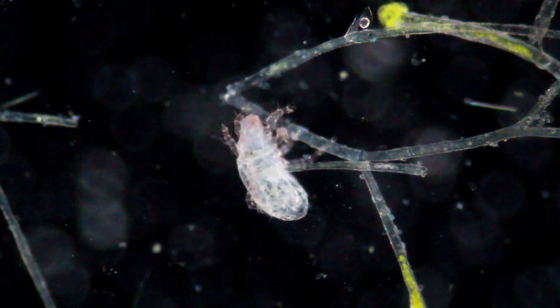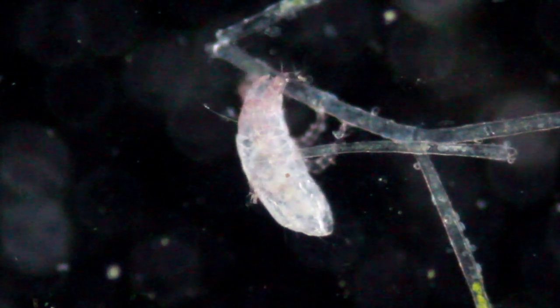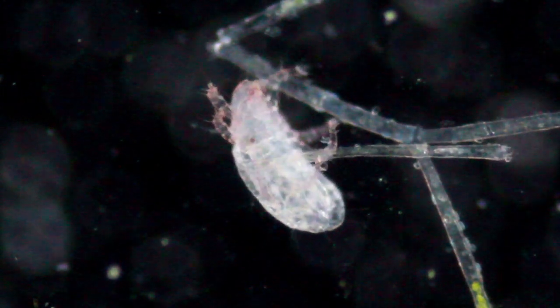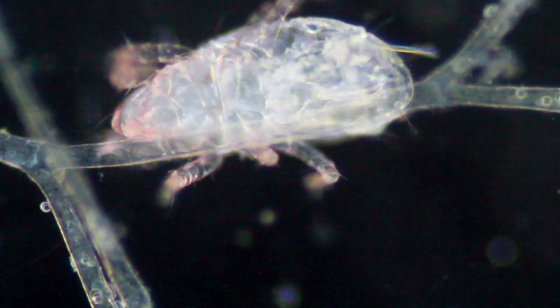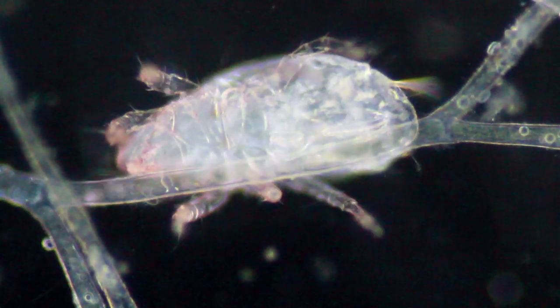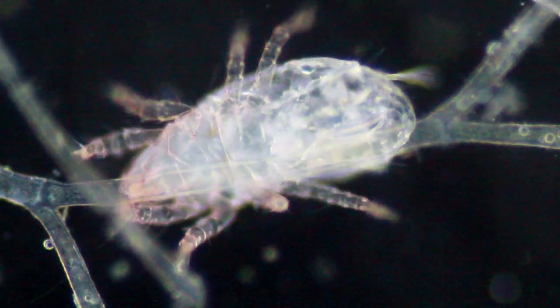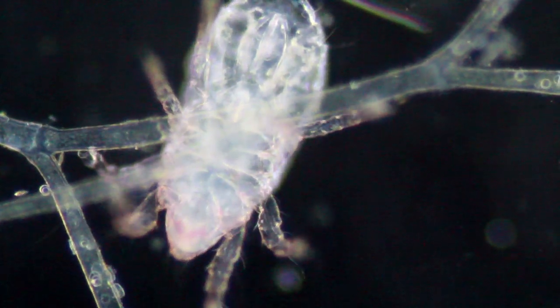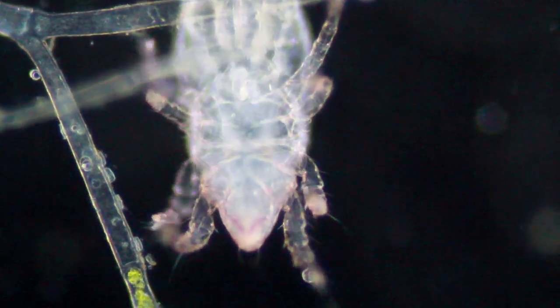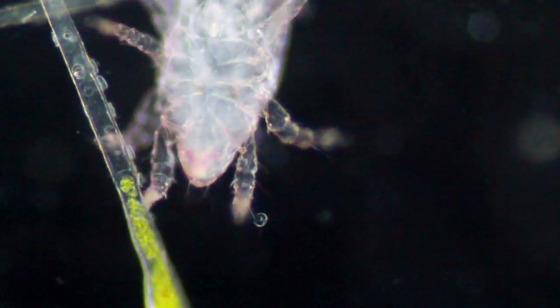Now this is in dark field, and you can see it looks quite nice — the mite looks a little bit transparent here. It's again trying to cling on to one of those algae. You notice already that the algae do not appear to be very green because of the age of the water sample — I think many of them have already died off. The smallest mites are around 0.1 millimeters across, so they're just barely able to be seen with the unaided eye as a small dot.